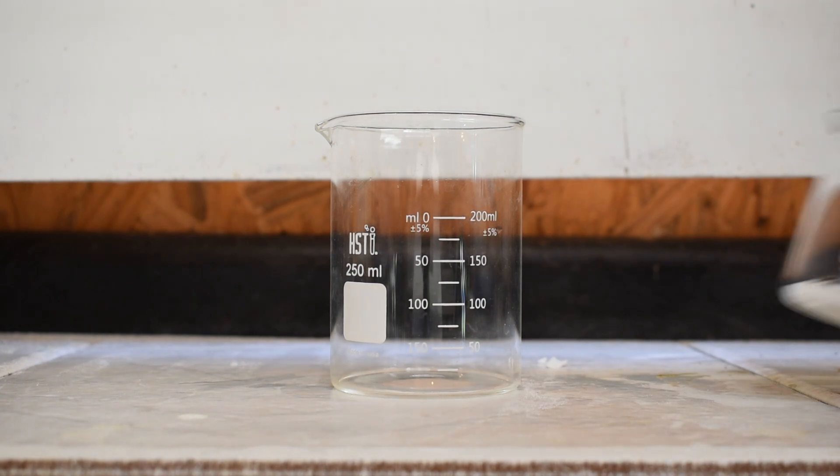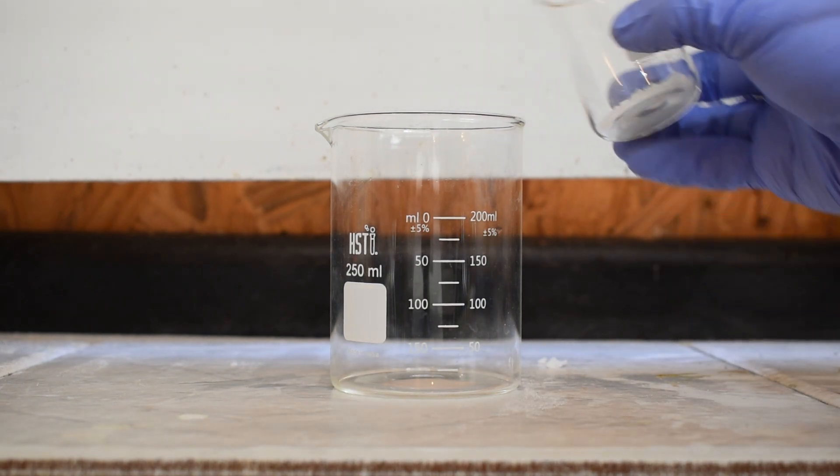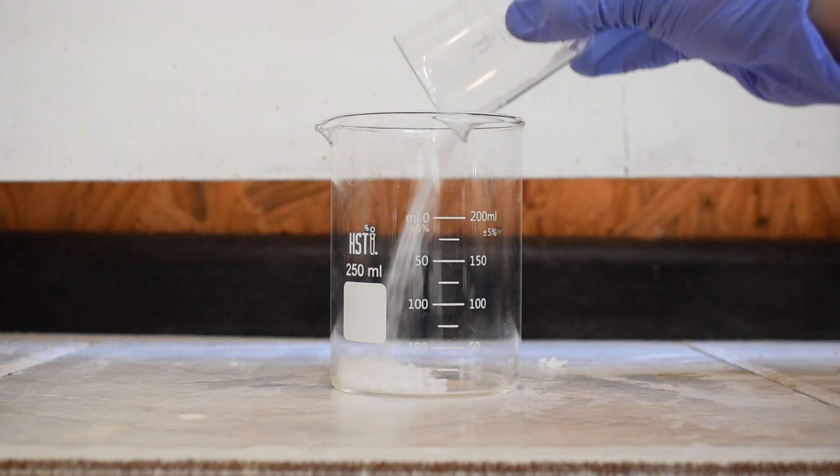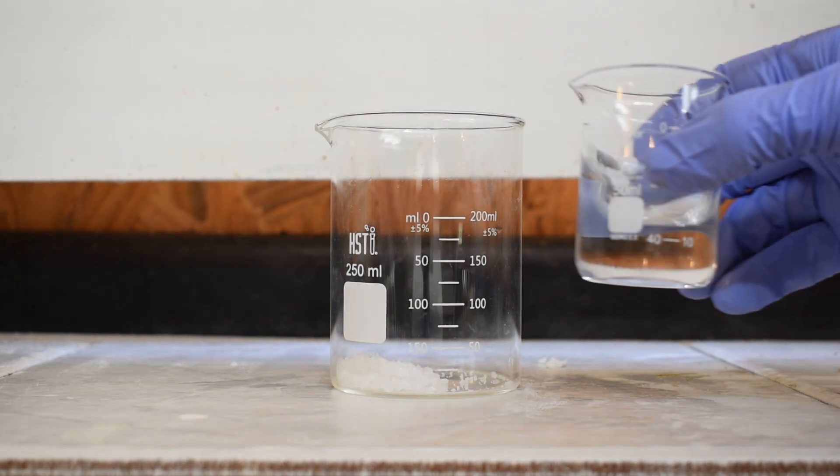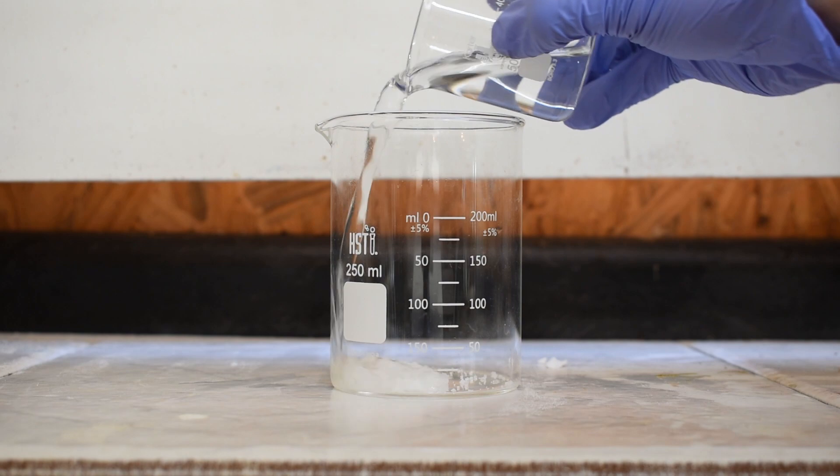Anyway, to get started we need to make some elemental iodine first. So to a beaker I added about 10 grams of potassium iodide. I then rinsed out the smaller beaker with about 30 milliliters of water.